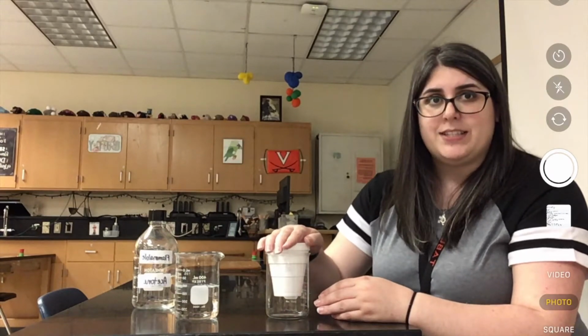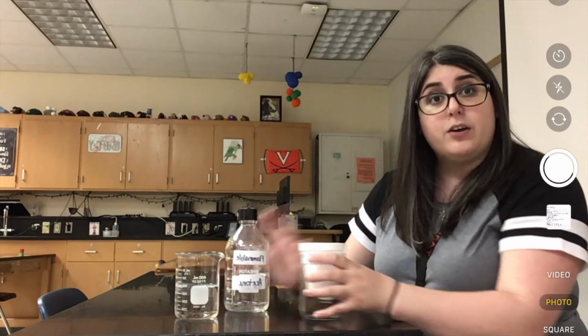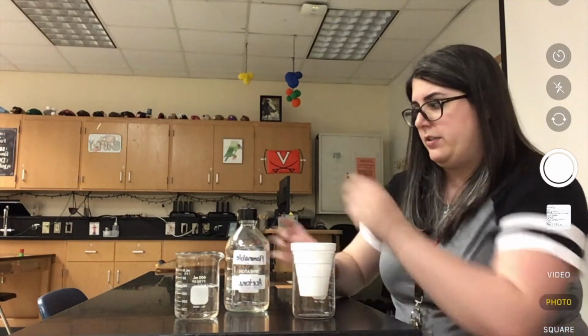The next thing we're going to look at is the acetone. Acetone, I am now going to interact again with the styrofoam cup. If acetone is polar, then we know it's not going to dissolve the styrofoam, just like water didn't. But if it's nonpolar, the same polarity as the styrofoam, then it's going to dissolve.